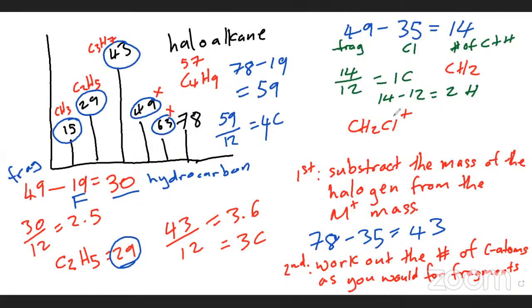In terms of the significant peaks, those are the ones with the numbers. So you can have other peaks in between, but we are not interested in those. Only the ones they give you the numbers for. All right, and you will work it out.